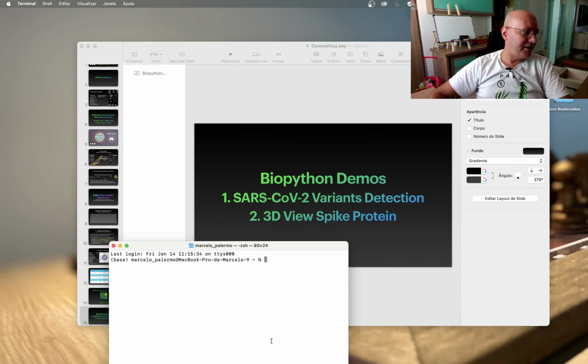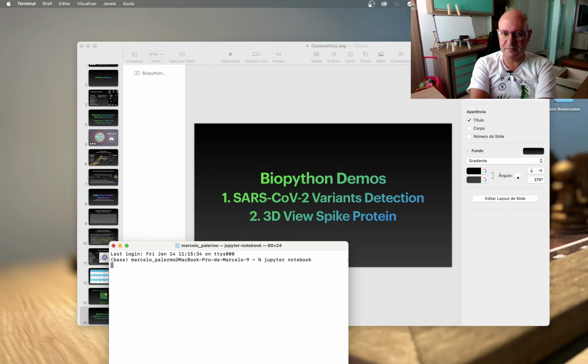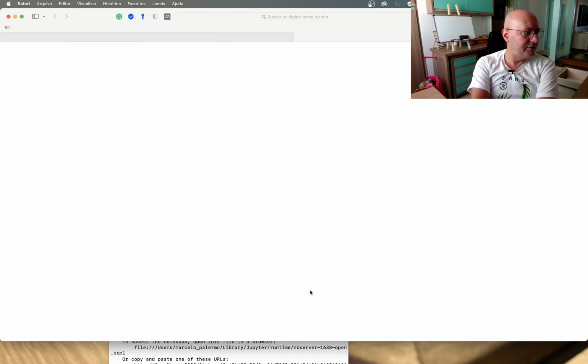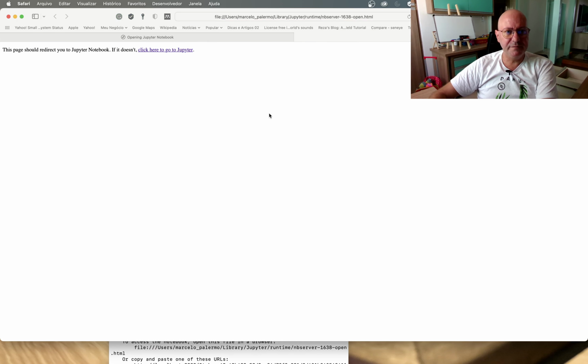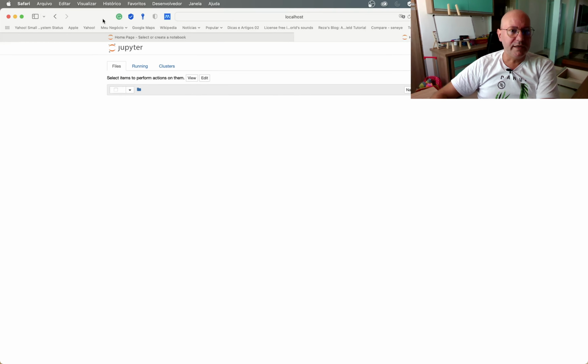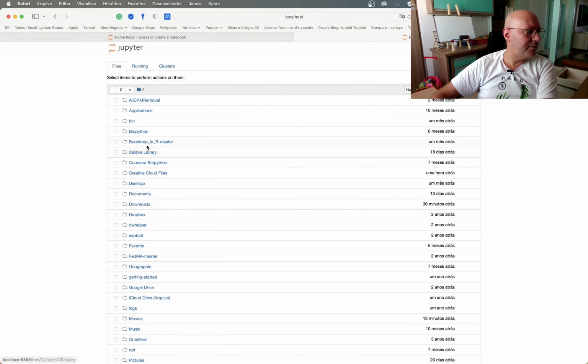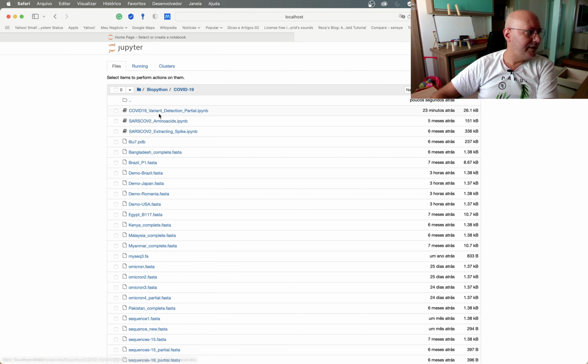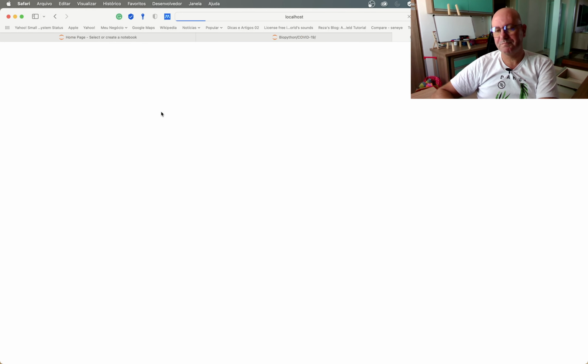So let me start up Jupyter Notebook, which is my Python environment, and I have Biopython on top of that. So I will open up my browser here. And here I am. I will go to my COVID-19 directory and I will go to my program.